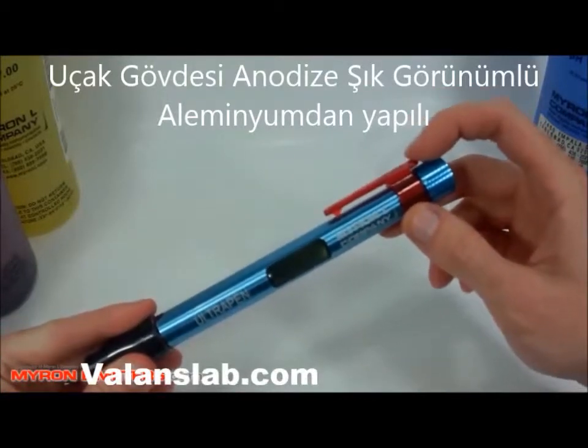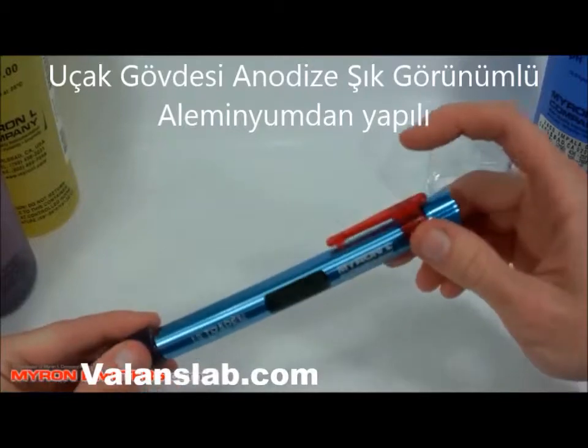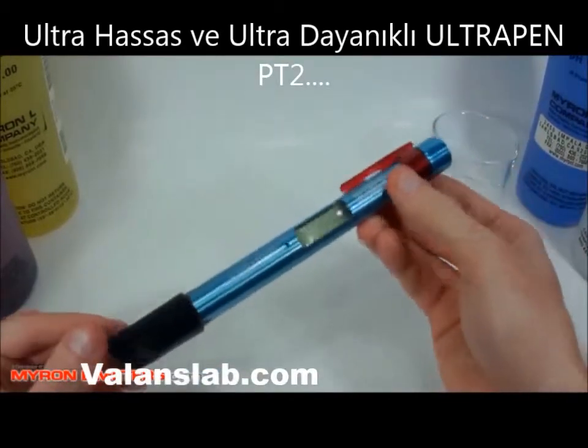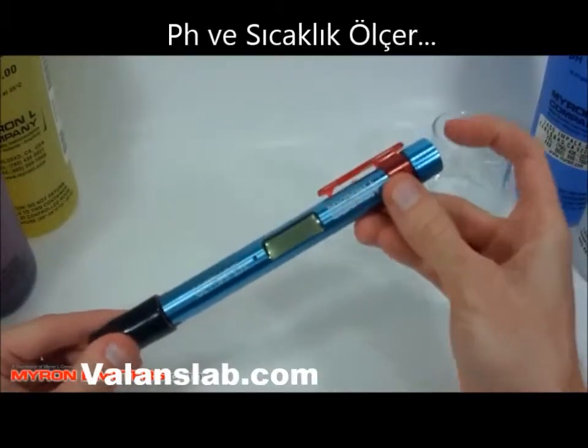It has a color-coded clip on the body which indicates the model and parameter. Red here is for PT2, the PH model. This instrument is very simple to use. You simply press the button here at the end to turn it on and take a measurement.